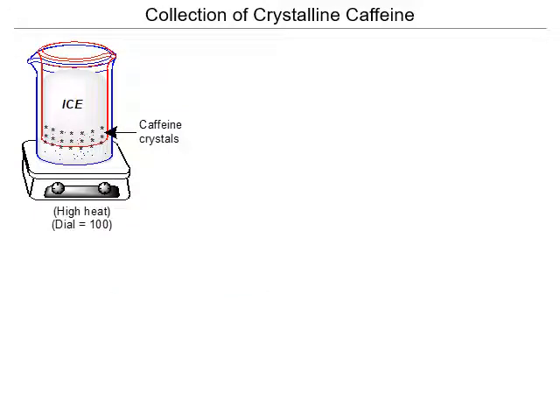Now, I remember when I performed this experiment, I realized the best way to collect these caffeine crystals after we sublimate them, right? Because there was a solid, it's not quite touching the white solid. It evaporates, it sublimates, and then it comes back as a solid here. So in a way, it sublimates and it deposits on the small beaker.